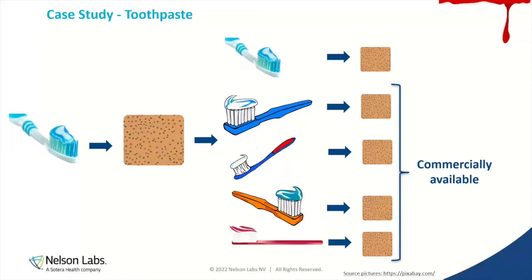And we were able to show similar levels of cytotoxicity out to a dilution level of like 1 to 1/16 or something like that. So this helped us to not weigh so much of the evaluation of the safety of the toothpaste on cytotoxicity. It's a nice test, but it's not the end-all be-all of biocompatibility. So we kind of wanted to, like Lisa said, find a way to not stay in this room for a very long time, but have a way to get out and move on to the rest of the assessment.